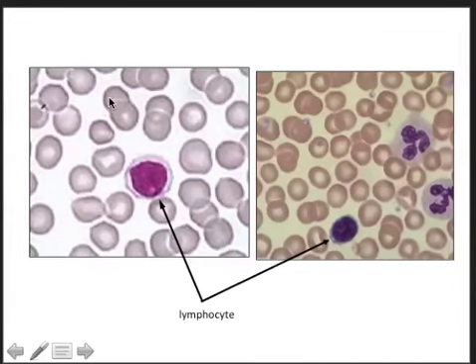So get used to looking at these blood smears because they're not all going to stain the exact same colors, but you can look for the general shape of the nucleus as a major clue, and also, again, the presence or absence of those granules in the leukocytes as a way to tell you which formed element is which in relation to the leukocyte population.